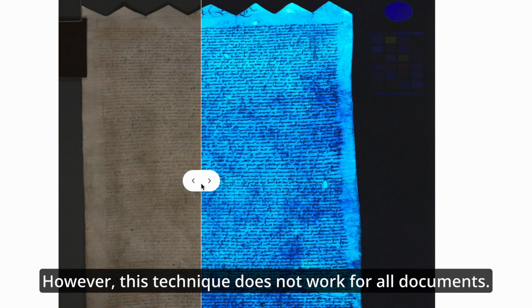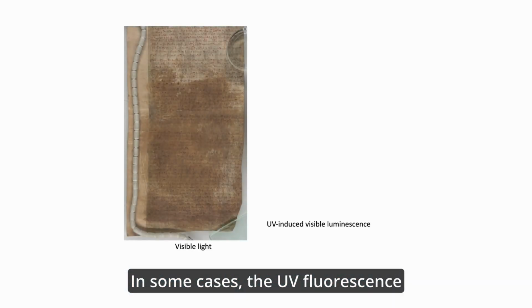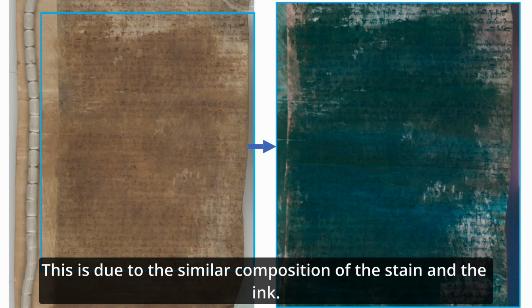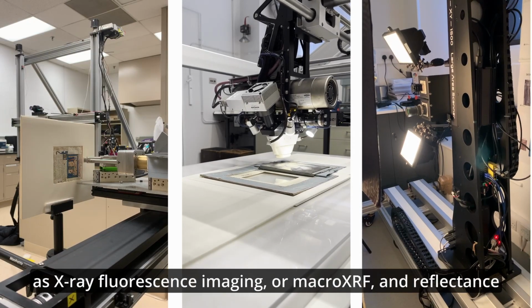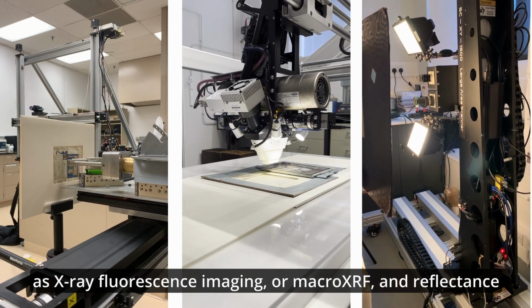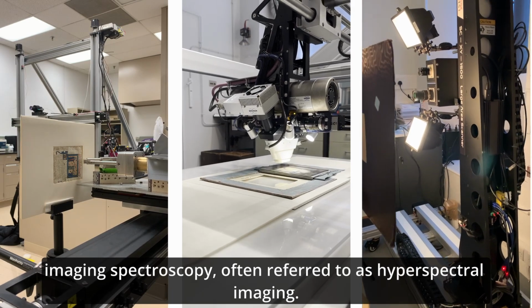However, this technique does not work for all documents. In some extreme cases, the UV fluorescence imaging does not provide better contrast. This is due to the similar composition of the stain and the ink. In such cases, we turn to advanced imaging techniques such as X-ray fluorescence imaging, or macro-XRF, and reflectance imaging spectroscopy, often referred to as hyperspectral imaging.